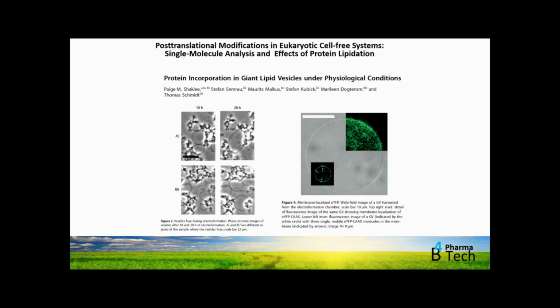Now, what about further post-translational modifications and other downstream applications for cell-free protein synthesis? Here you see a single molecule analysis where we used EYFP harboring a CAAX box. Those proteins harboring a CAAX box are typically lipid modified. By lipid modification, these proteins are attached to the lipid moiety, whereas otherwise EYFP would be soluble. So here you see that this protein clearly follows the membrane. The inset here is a single molecule analysis, which was published with our partners, the lab of Thomas Schmidt in the Netherlands. So the production of lipid-modified proteins is possible in this cell-free system, and even fluorescently labeled proteins for single molecule analysis and for the detection of protein-protein interaction on a molecular level can be facilitated by cell-free protein synthesis.